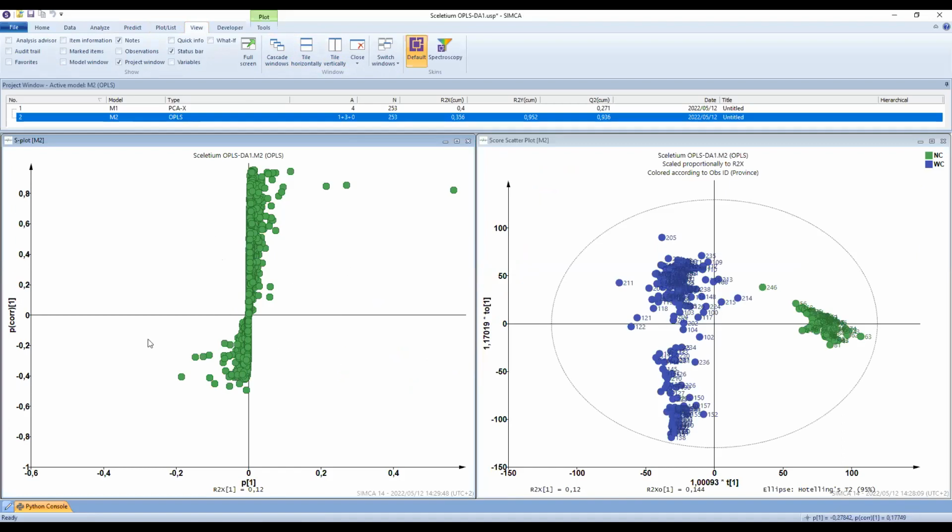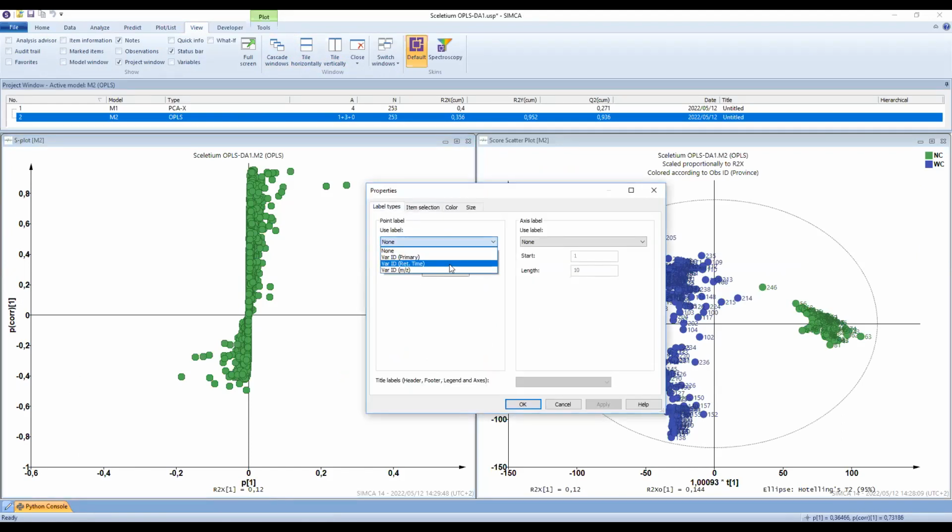You remember the demonstration we got from the matrix S plot? The samples that are sitting on the right are correlated to variables that are going to be filtered out on the right of the S, which is the top right of the S. Samples on the blue, on the left, are correlated to variables this end. Okay, so in this case, the few variables, let me label them with retention time.